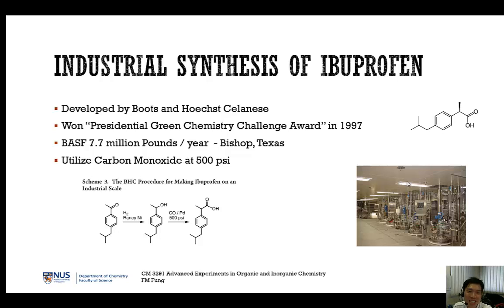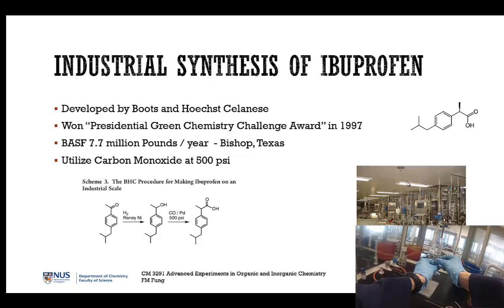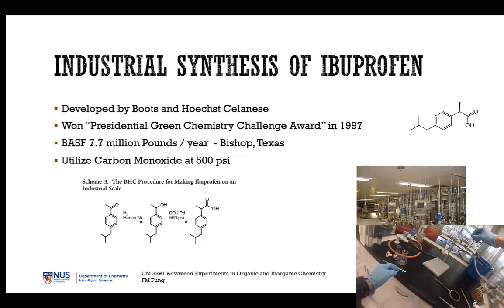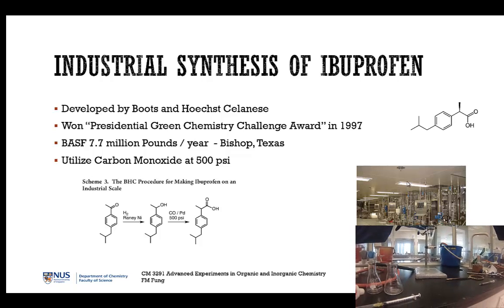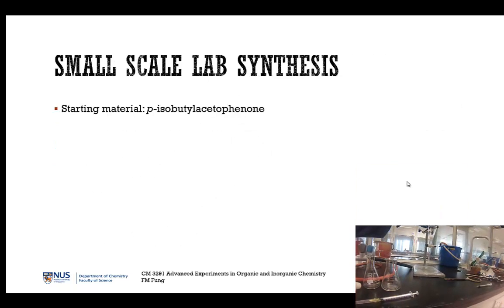Unfortunately, this BHC procedure in Scheme 3 is not suitable for use in this lab. So, to employ techniques and reactions that we understand, we will choose to pursue the Grignard route, as described in a later part of the video.